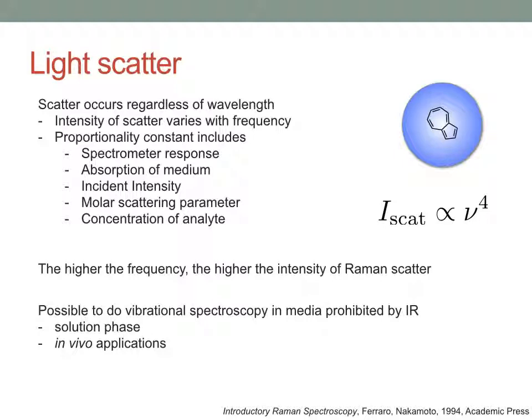And if you've ever had a wet sample, you know very well, you can see nothing. That OH absorption, which is broad anyway on your infrared, all of a sudden starts to mask all the peaks that you want. As soon as I'm in solution, I get nothing. Whereas Raman can tell me all sorts of information about solution. And I can take that further, not just looking in aqueous solution, but looking in vivo, looking into cells.